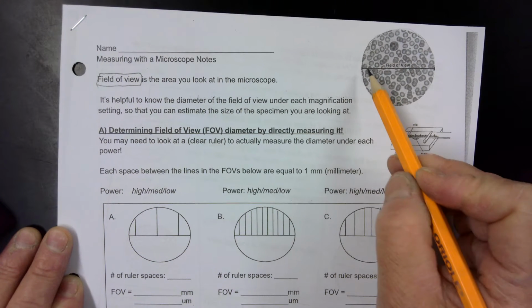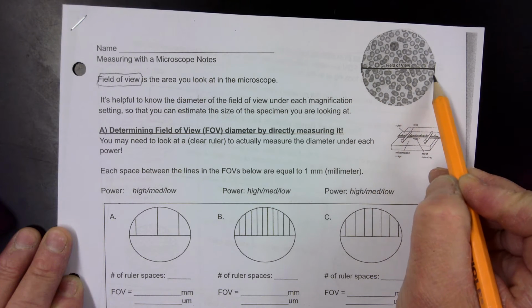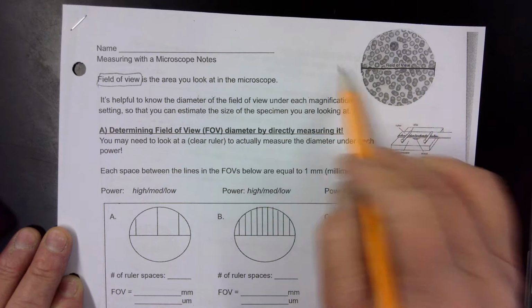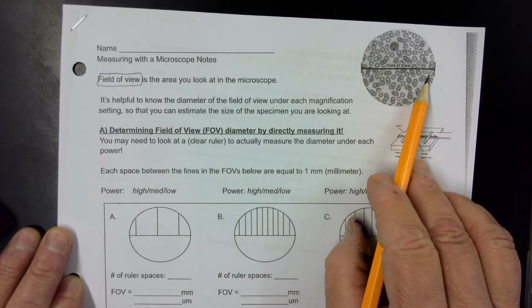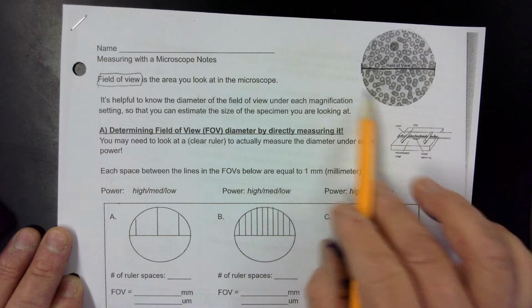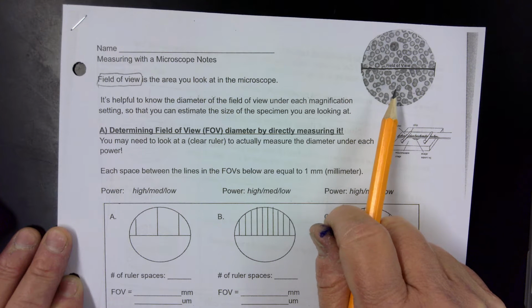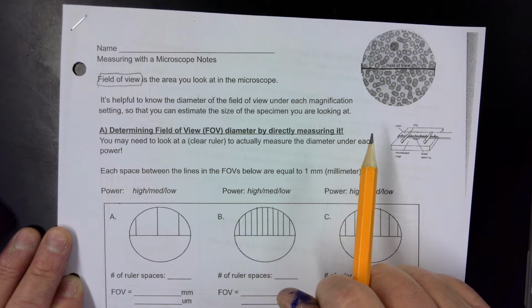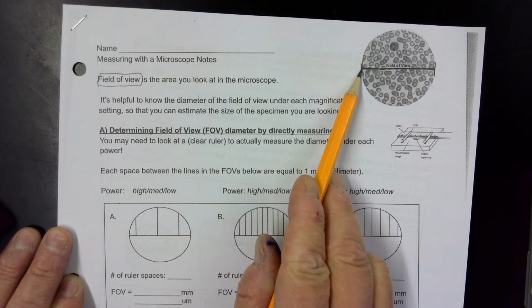What we need to know now is, what is the diameter of your field of view? If we know that diameter, we can count up the number of cells that go across the diameter, and then from that we can do the math to figure out the diameter of each one of those cells.